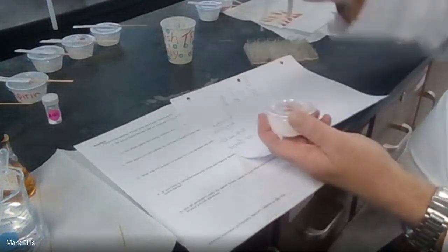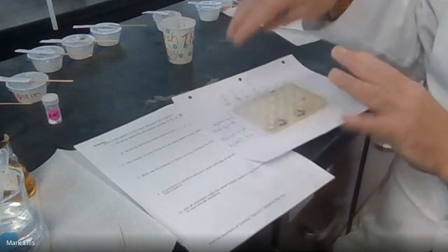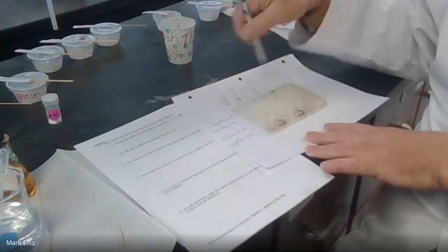One of your lab partners could be breaking off toothpicks as needed, tearing the pH paper as needed, even taking off the caps, and whoever's going to do the dropping the things in, somebody needs to be watching to make sure you're putting the right things in the right row and the correct column. That's what's going to mess up your results. So neatness and attention to detail. It's not super neat like in an art class or anything, but I've got things organized and I know what I'm doing. If you take a cap off, put a cap on, do not cross-contaminate anything.